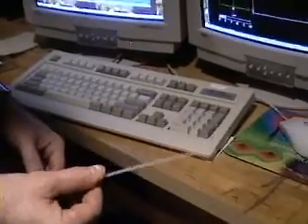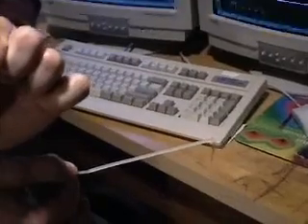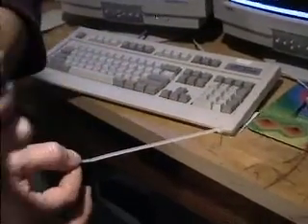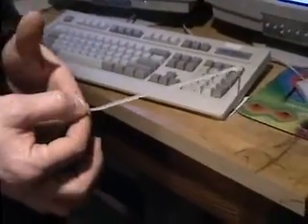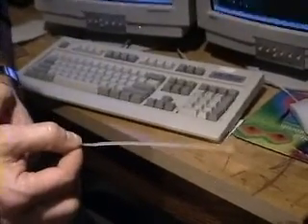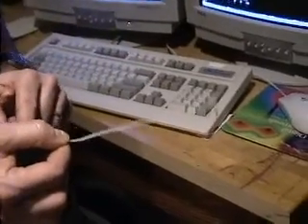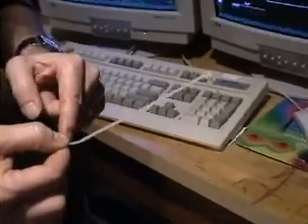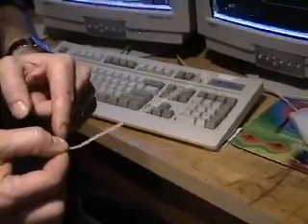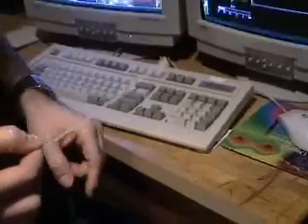Here's my little model for our cantilever, and at the base of it, in the little cantilever holder piece that we took off in order to mount the cantilever, there's a small piezo which is going to be oscillating, and we want to oscillate it at just the right frequency so that it matches the resonant frequency of the cantilever. By doing that, I can have the oscillation amplitude here be quite small and still get a big oscillation amplitude out here, which is important.